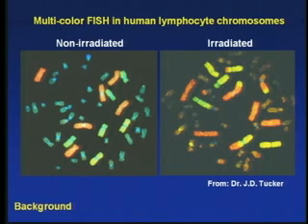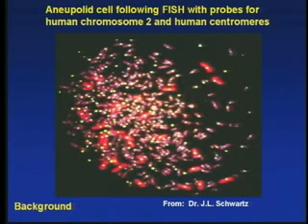any mosaic indicating a chromosome exchange. So this will not only allow you to determine how much exchange, what exchange happened, but also will give you an estimation of the radiation dose, meaning the higher the radiation dose, the more frequent the exchanges will be. And also this is a great method of revealing those reciprocal translocations where you really couldn't tell from simple morphological observations. Or, for instance, in this case, you can have a marker for the centromere, so you don't have to worry about the details of the chromosome. You just count those bright dots because each dot represents a centromere.